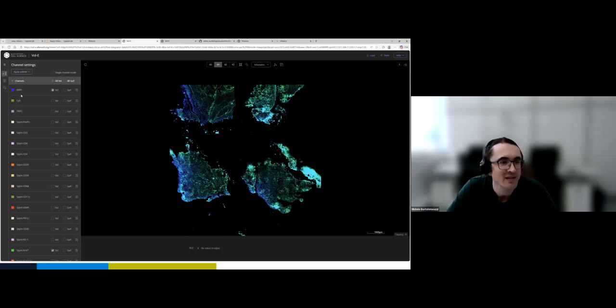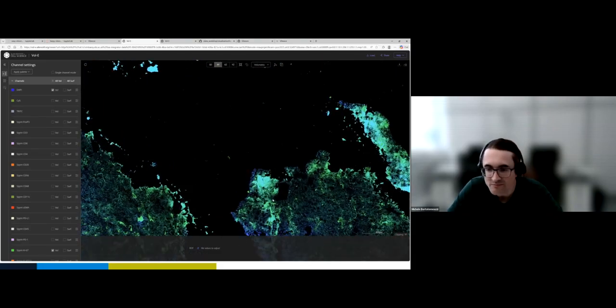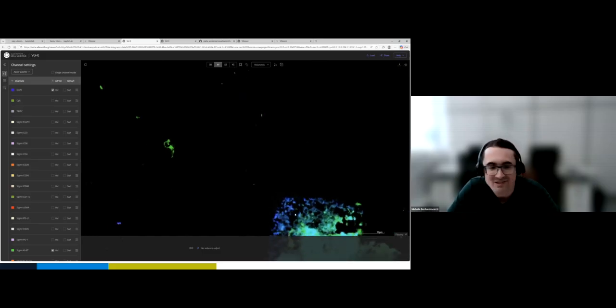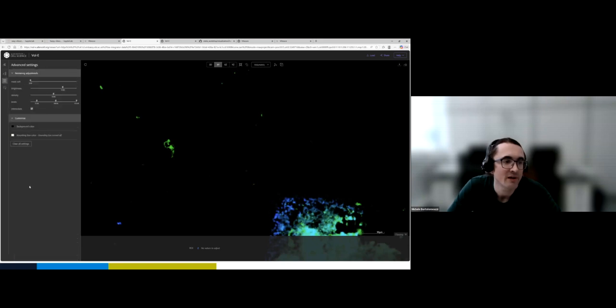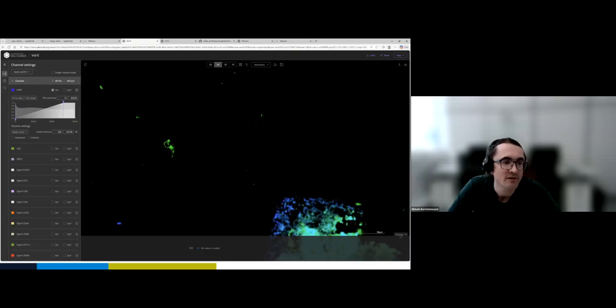But what is really nice about this is that we are already viewing, with not much effort, an image that is on the very large side, and we can get quite advanced rendering settings for all the channels.